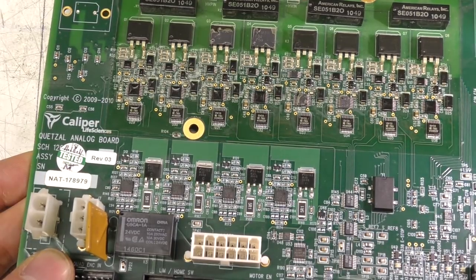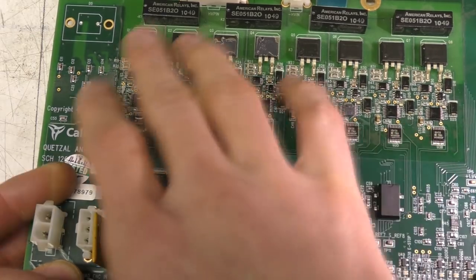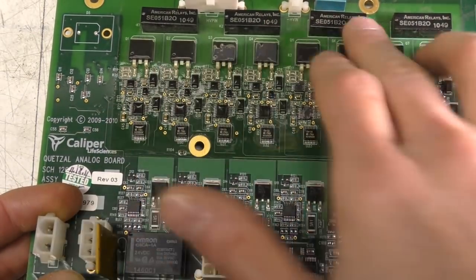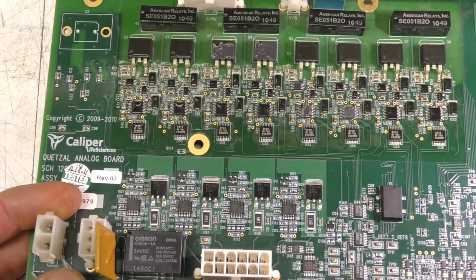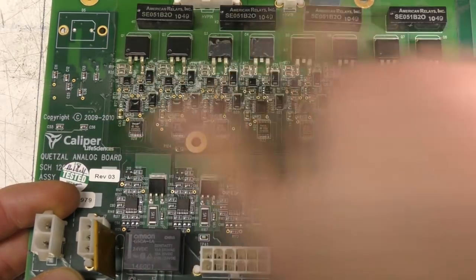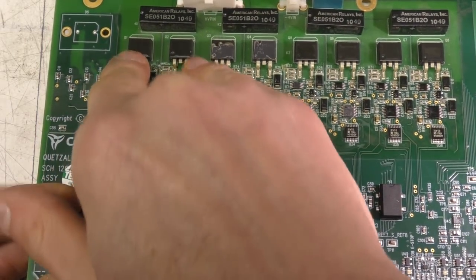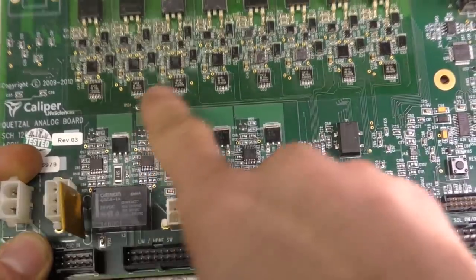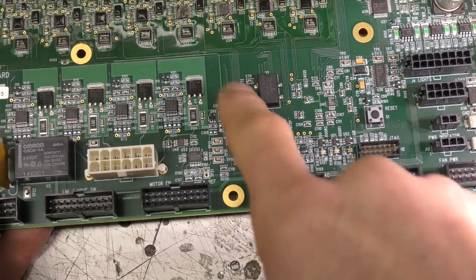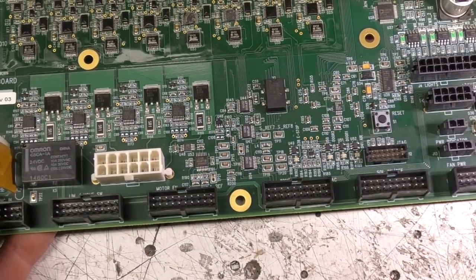That interlock circuit on the top certainly interlocks the lasers, and it may well also control these reed relays. Well, I'm surprised they didn't. If these are just for interlocking, I thought it might be easy just to switch the power to the high voltage power supply, but maybe there's other reasons for these switches being here. And there's two 500 volt P-channel MOSFETs on the output, various analog op amp stuff, and these are driven by a D to A converter. There's probably some current sensing feedback on here, I'd imagine, as well.